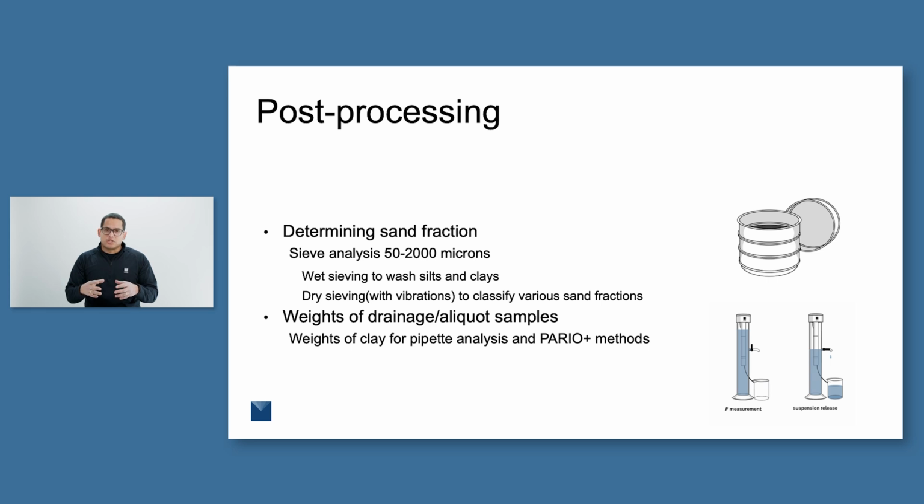Now, there is a certain amount of time and vibration that's needed to get the particles to actually move through the sieves. This can be done by hand in some cases, but it's usually a little bit better done by machine. And so those are just some of the things that you need to think about when it comes to your sieve analysis. Weights are really important here, as you can imagine.